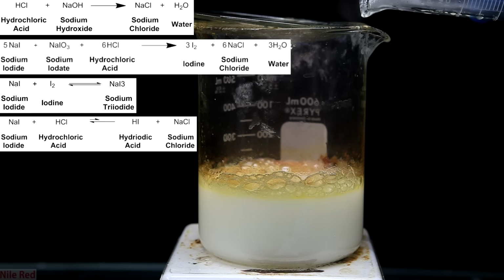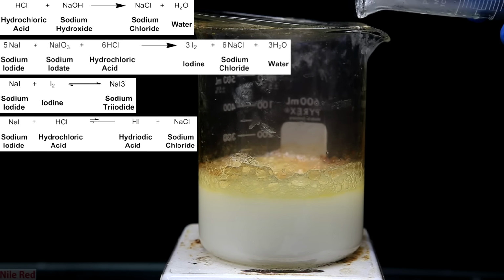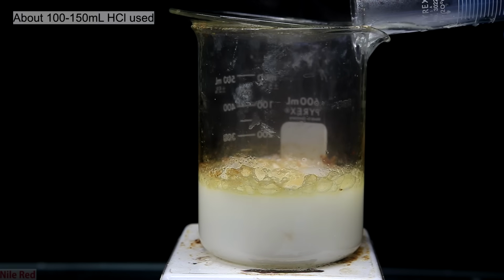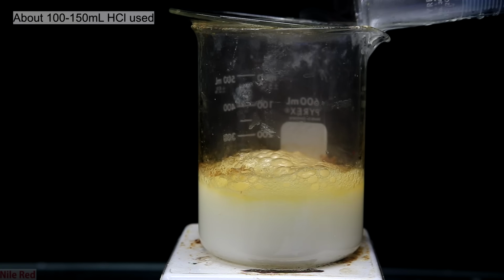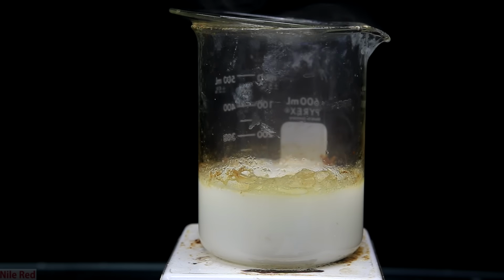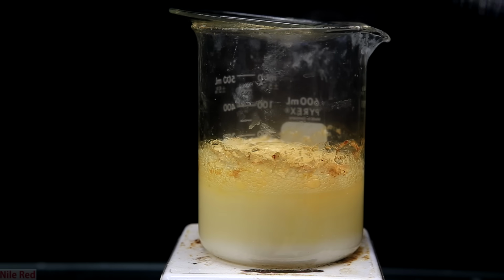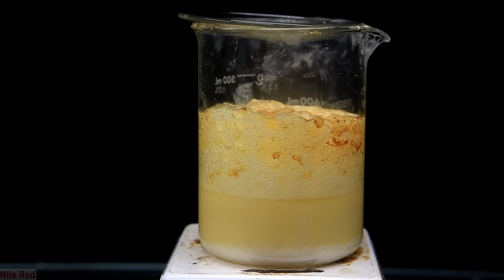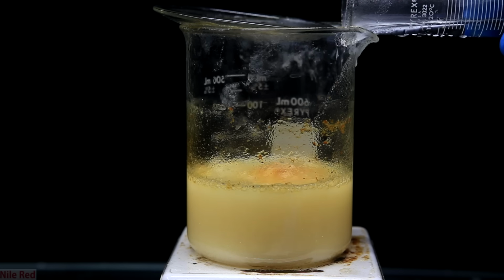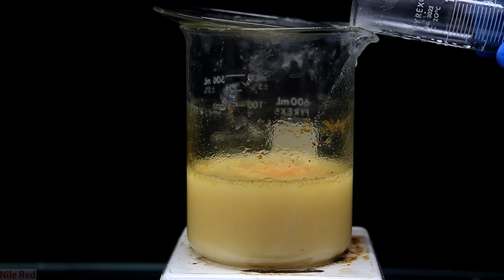The amount of hydrochloric acid here will depend entirely on the concentration of the iodine-povidone solution you used and how much sodium hydroxide you used in the beginning. In the end, I don't remember exactly how much I added, but it was in between around 100 to 150 milliliters. The solution is white, but as more is added, there'll be a point where the solution becomes yellow. When the solution becomes yellow, this is our end point. Once it reaches this point, I add more hydrochloric acid to make sure there's an excess.